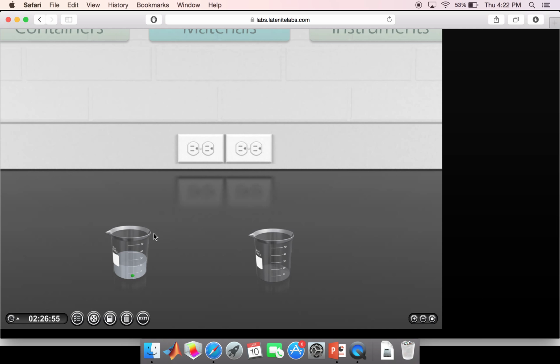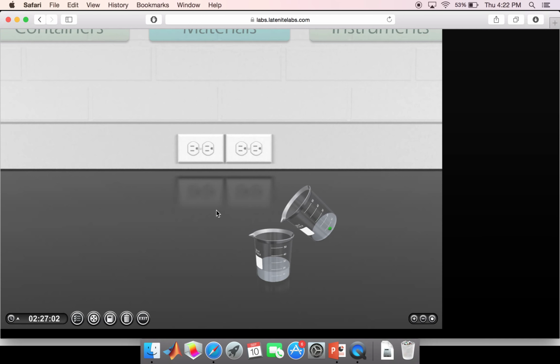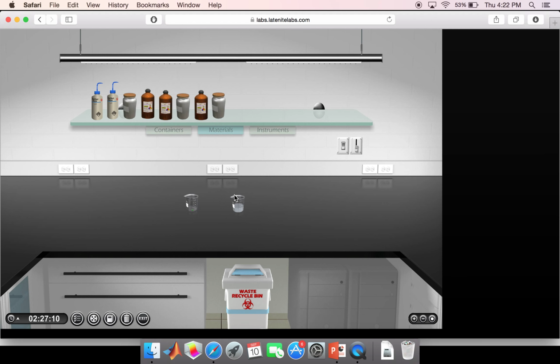If we want, we can zoom in and decant, or separate the solid from the liquid to observe more clearly. The reaction is a precipitate reaction that my partner will explain in more exact terms after we clean up our virtual workspace.